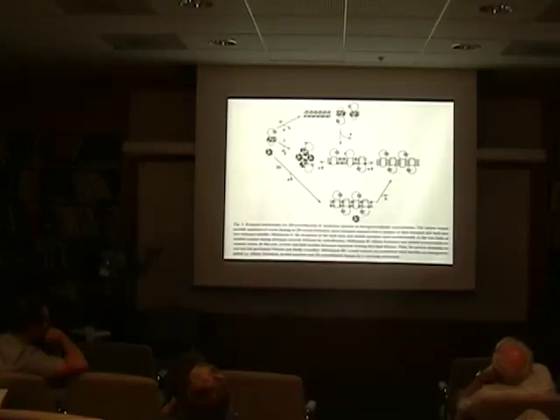In that case, I remind you that the amount of lipid is much lower, and the lipids also participate in the mechanism of crystallization. There is the most favorable mechanism in which first the detergent is depleted from the mixture of ternary and binary micelles, and then a bilayer forms in which the protein is inserted. There is still some detergent, and upon detergent removal, there is crystallization. So the three steps, depletion of detergent, formation of bilayer, and crystallization, are separate steps. The other mechanism is that all of these three steps occur at the same moment.